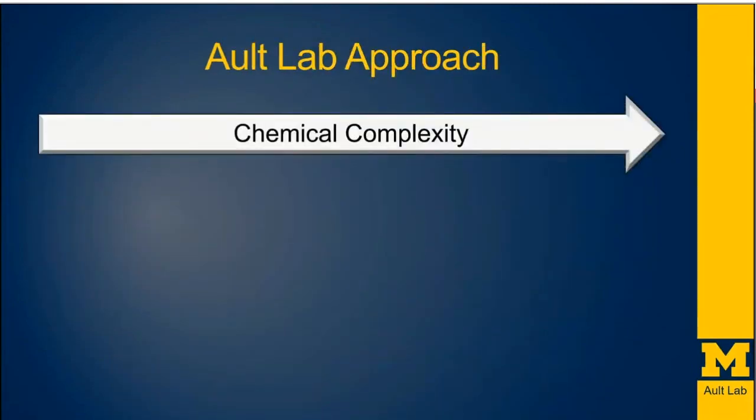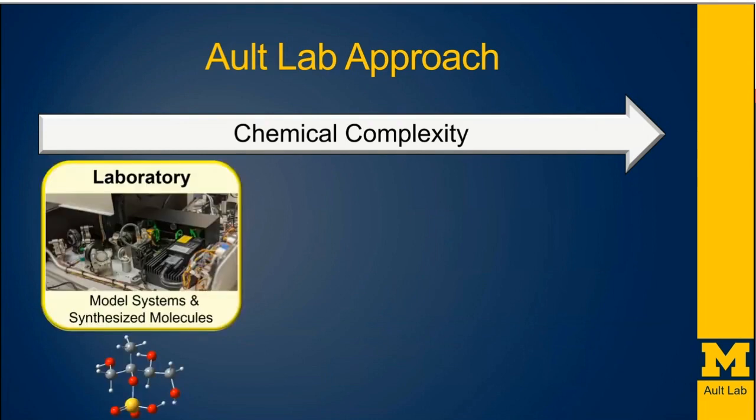So when we approach any of these problems that we're interested in, be they air pollution, haze, naturally emitted particles, or microplastics, we take a sort of one foot in the lab, one foot in the field approach to it. And we think that this really helps keep us grounded, but also tackles the complexity of the real world. And so we start in the lab where we use model systems, synthesized molecules, very simplistic but well-characterized samples that we can understand, connect with things like density functional theory, other sorts of computational or experimental methods that are really going to give us an idea as to what's going on with these particles.